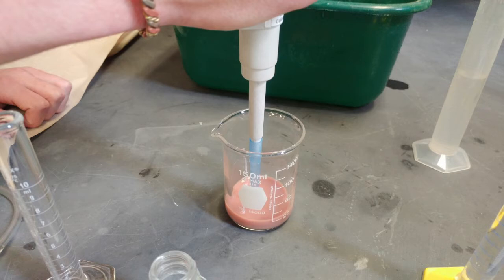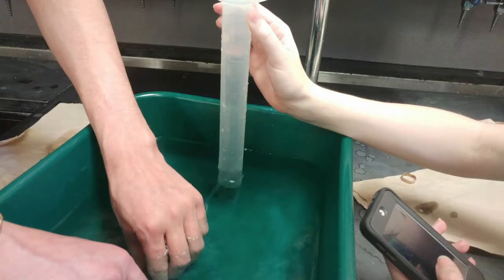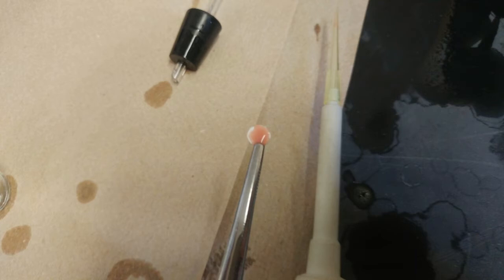All values measuring oxygen production under 10 milliliters would have had error, as the graduated cylinder we were using had measurements starting at 10 milliliters, and so values below this amount had to be estimated. There were also instances where the catalase would start to run down the walls of the reaction chamber while the substrate was being added, which could have led to a small reaction taking place before it was set up to measure oxygen production. Allowing the test chamber to dry between trials would have helped to prevent this, but as we were short on time, we did not have time to allow it to dry completely, and paper towel was not very effective in drying it out.